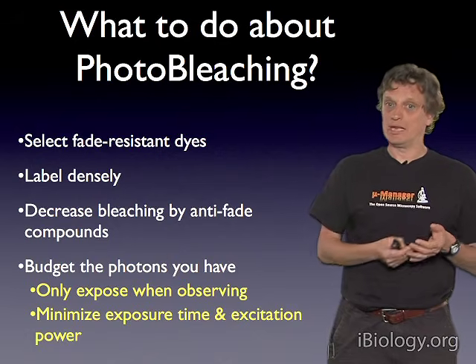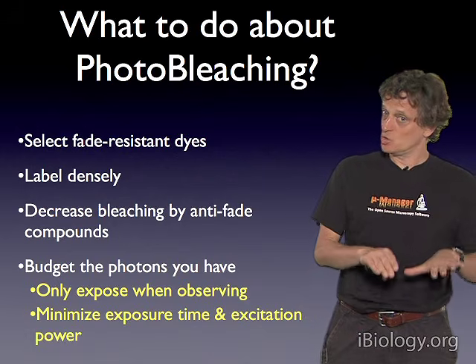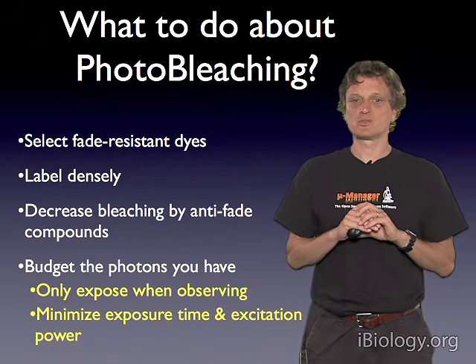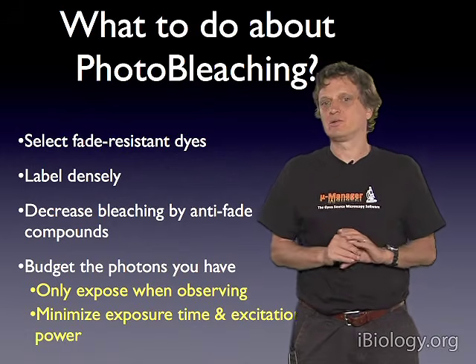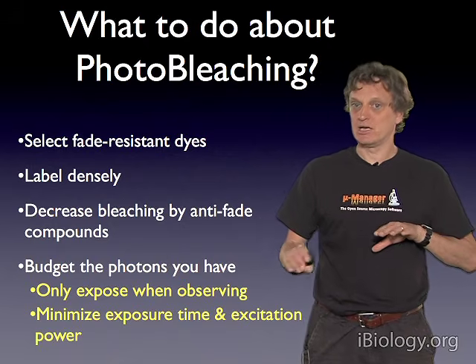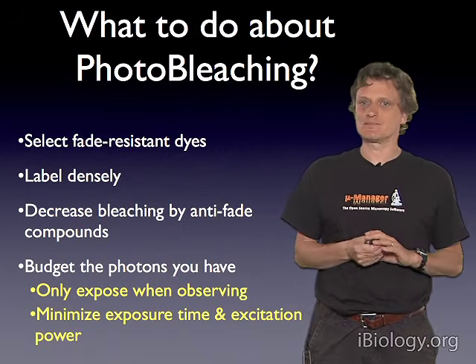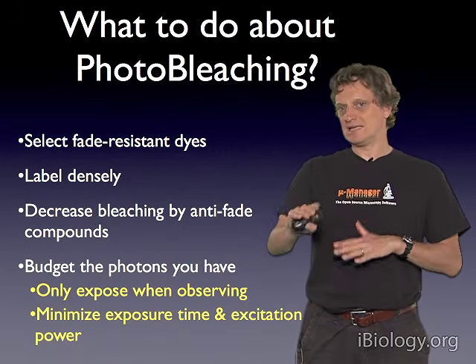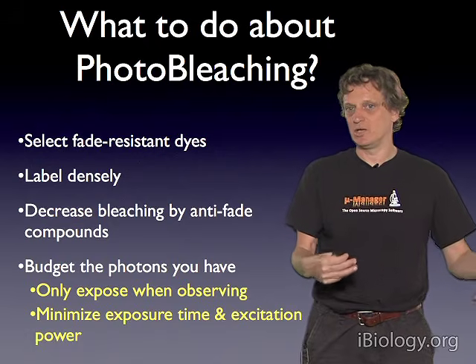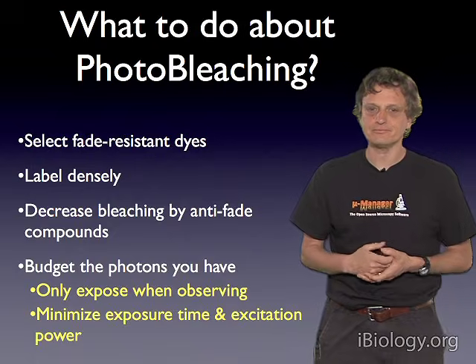Or when you're doing camera-based imaging, you want to take the shortest exposure times possible using the lowest amount of excitation light that you can. And you also want to synchronize your camera with the shutter as tightly as possible so that there's no dead time in which you're not actually collecting that fluorescent light.